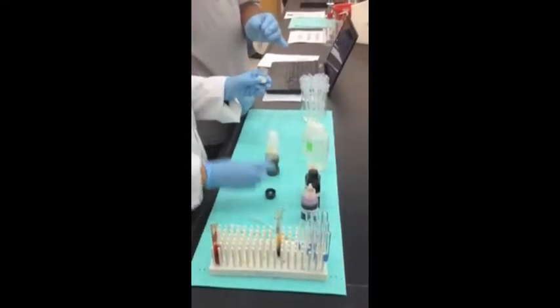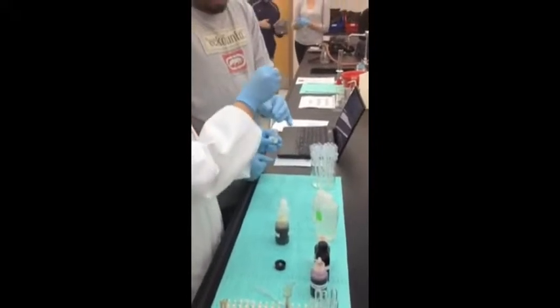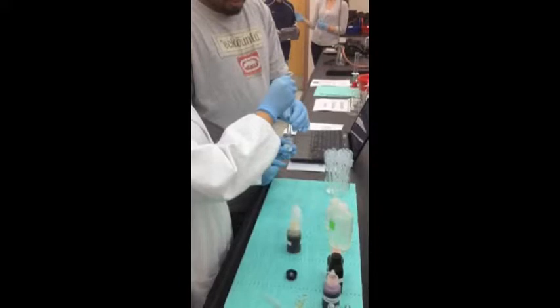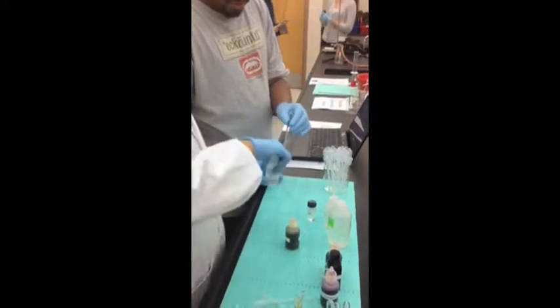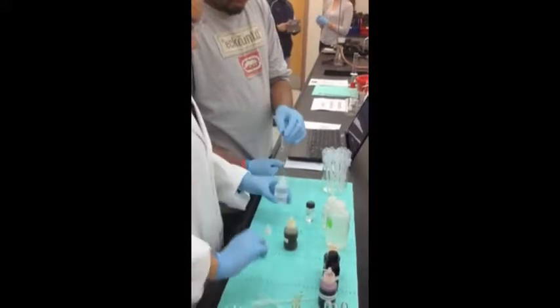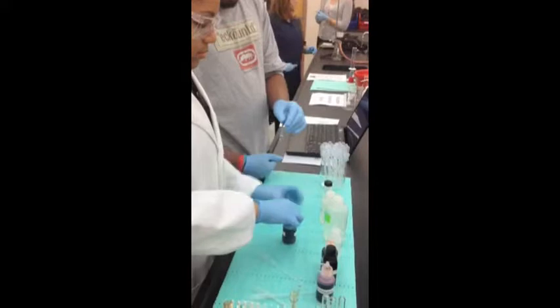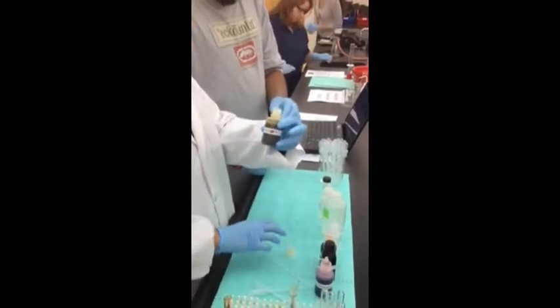On test number two, we add one drop to the test tube, one mL of ethanol, and two mLs of DNPH.